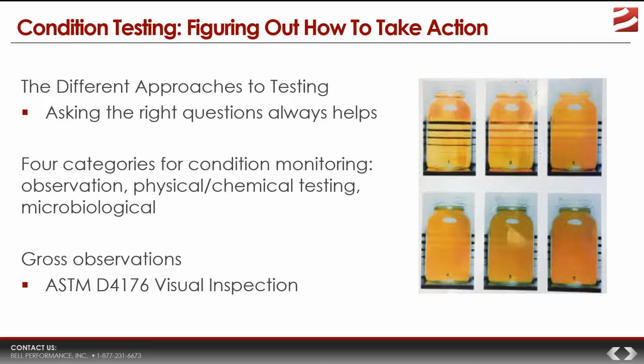Now, these three questions seem to be interrelated in some way, but they're not all answered in exactly the same way. This means that we really need to know the right testing approach to take if we're going to best answer these right kind of questions. And these are the kind of considerations that go into what fuel microbiologists refer to as condition testing. See, we have transitioned from condition monitoring into what is now condition testing.